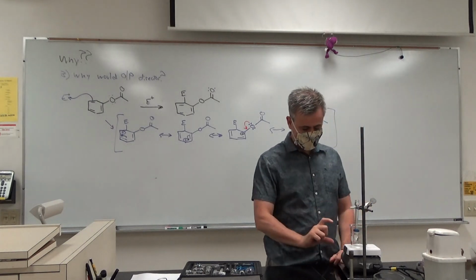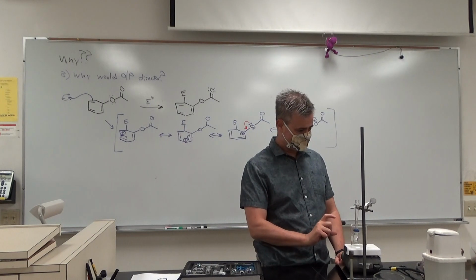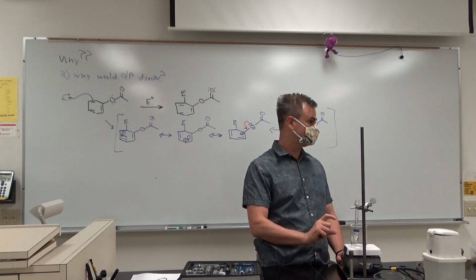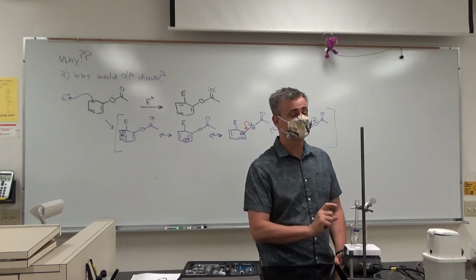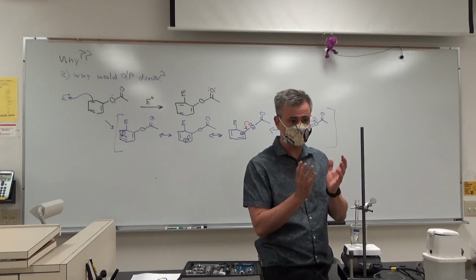And then you've got your mixture of nitric acid and sulfuric acid in the small little itty bitty test tube, okay? And that test tube with this incredibly corrosive mixture is in what? It's in a beaker, right? We always keep that kind of dangerous stuff in beakers so it doesn't tip over.